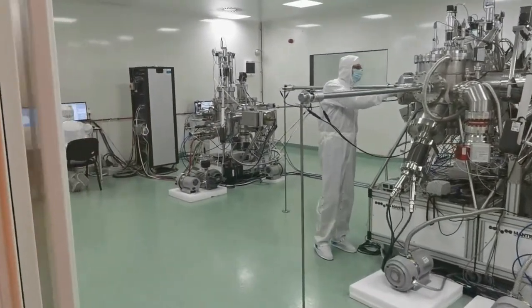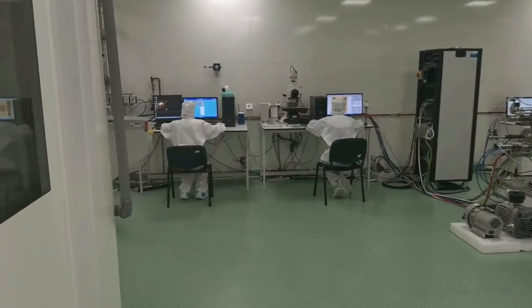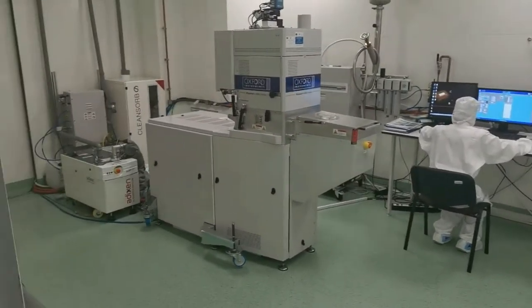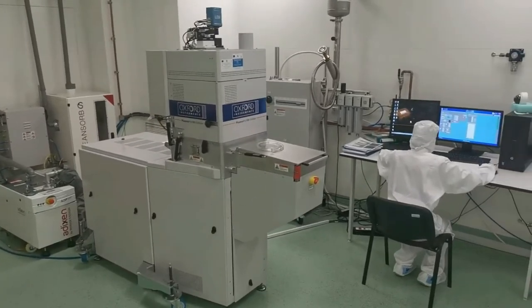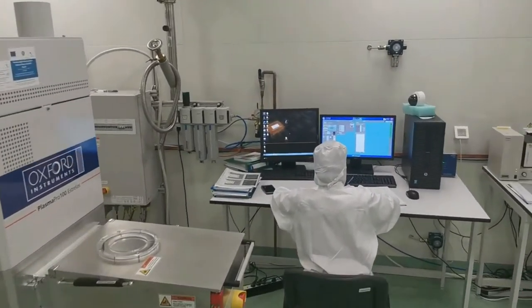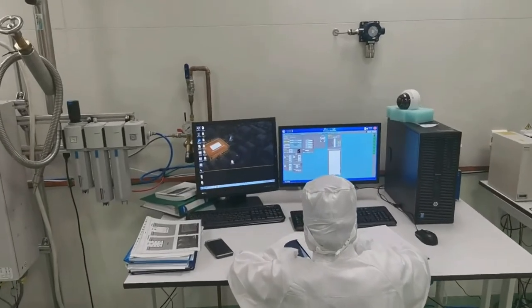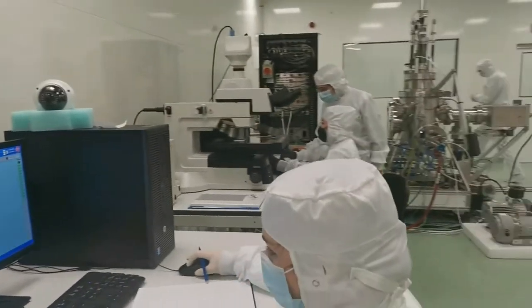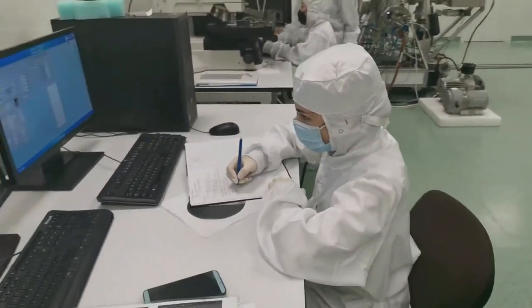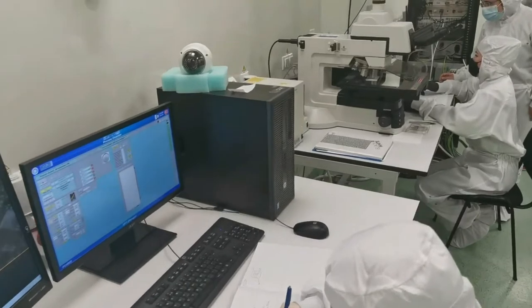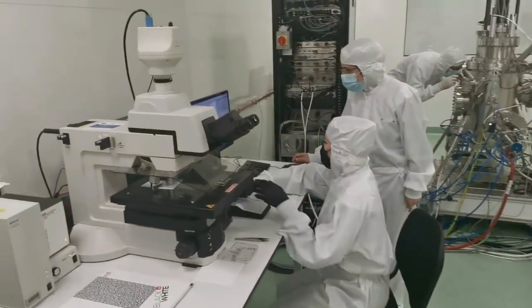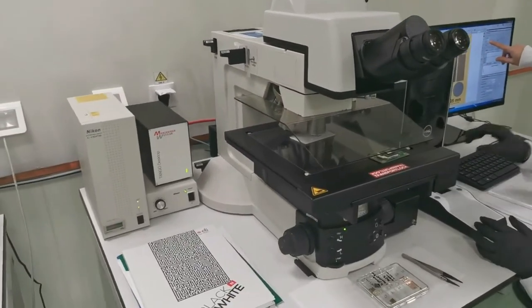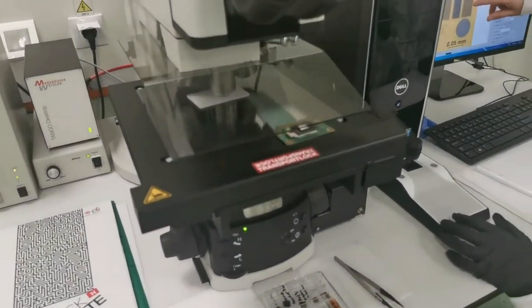The reactive ion etching tool is used for surface structuring via chemical and physical dry etching by means of inductively coupled plasma, equipped with an ICP source and two high and low frequency generators. This system allows for Bosch and cryo etching technologies in the same chamber for yielding vertical structures with smooth sidewalls and a broad height to width ratio. Several optical microscopes are available for performing fast analysis of surfaces.